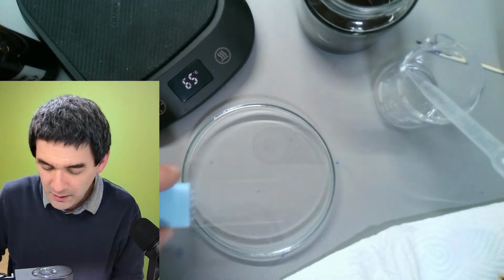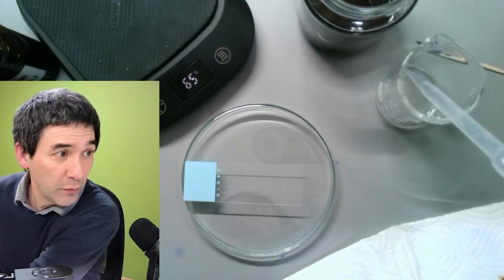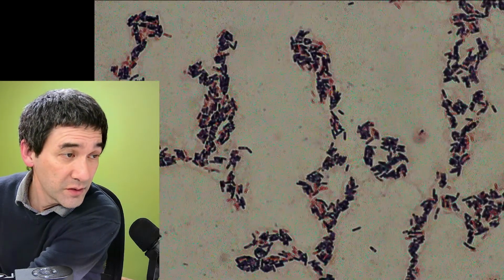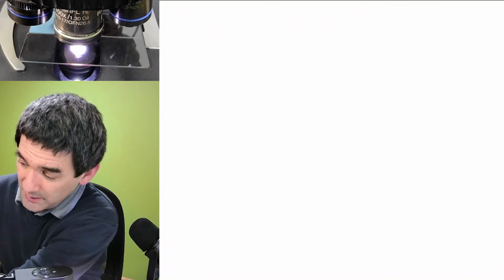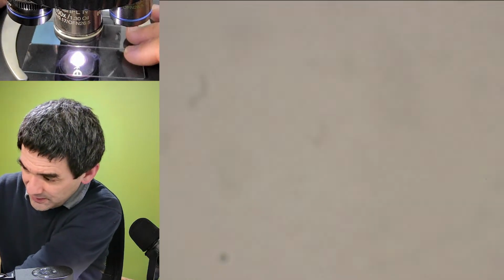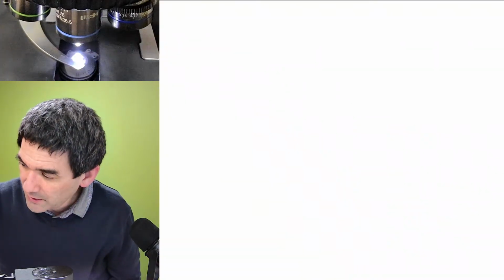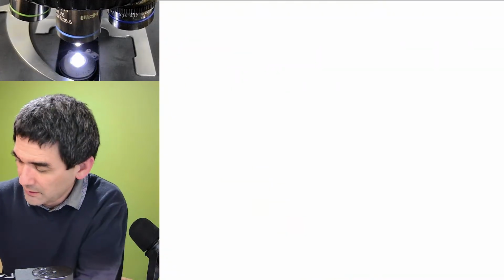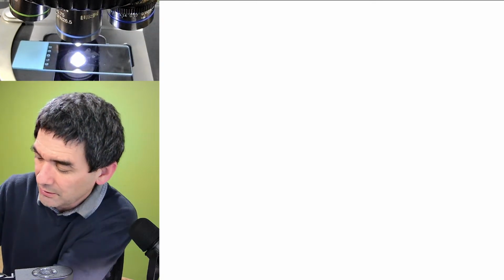So, I'm going to now do the following. I have to move away the scope view. So again, let's put it away. I'm going to remove now the two slides. Let's put them to the side, here and here. Different magnification. And let's just look at the saliva without anything here.